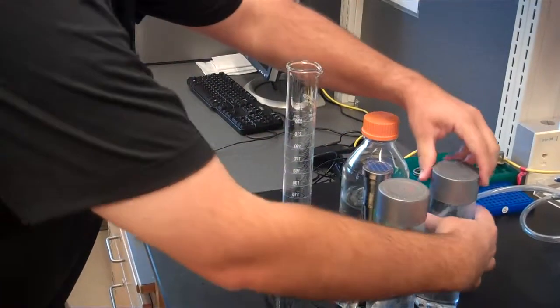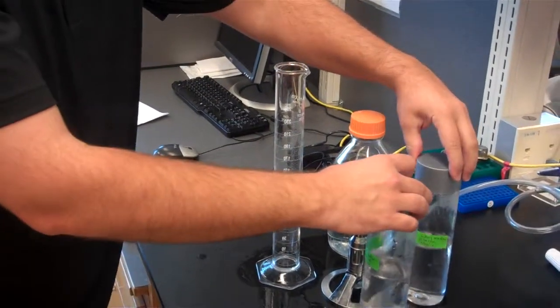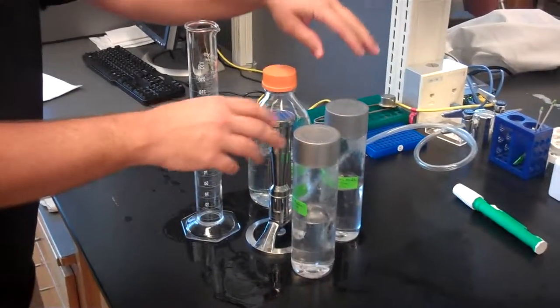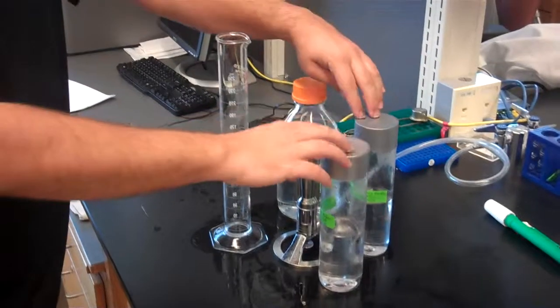Both bottles are sealed. They were in the sterile field the entire time. So these two bottles should be nice and sterile for the second step for the biology classes or for the AP environmental students to put the algae into the media bottles.